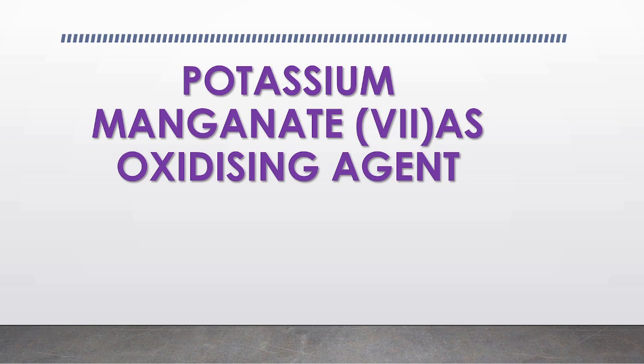Potassium manganate solution is of purple color. It is used as an oxidizing agent, and also it is used to check the saturation of a compound. Like it can usually be decolorized when it is treated with an alkene. So let's start the video.